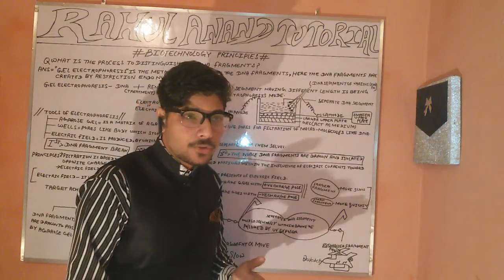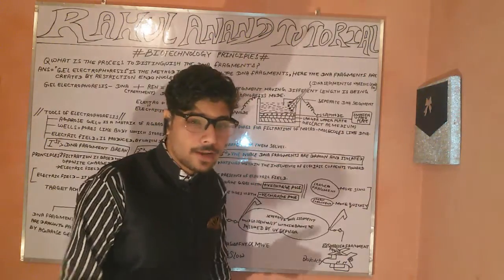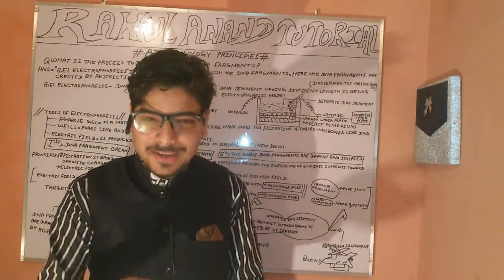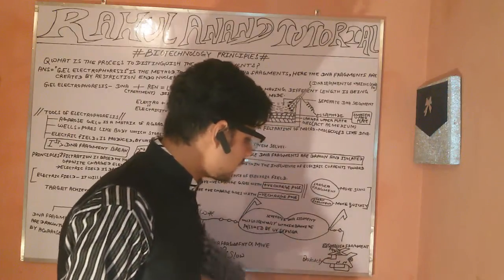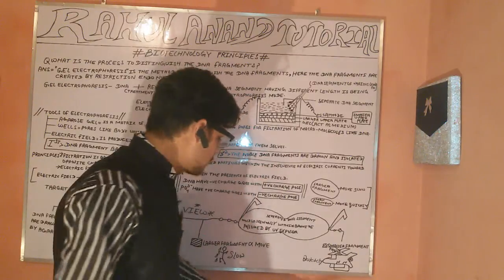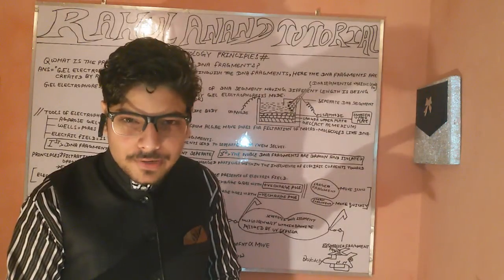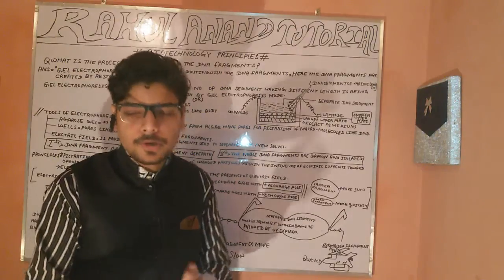Like when we are walking, we travel a short distance. But when we use vehicles such as an aeroplane or a helicopter, we travel a long geographical distance quickly. So you could find here that the smaller molecules will be traveling quicker. Larger molecules will play an important role and will be transported, but at a slow rate as compared to the smaller ones.